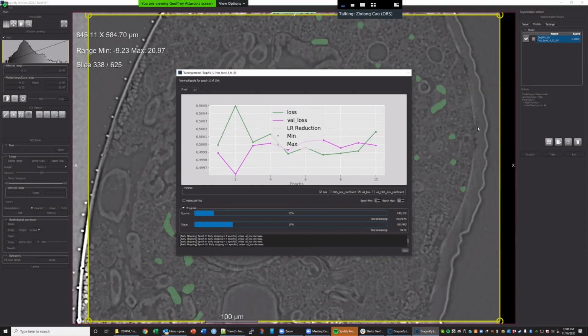Ideally, it should work better for most images, but it takes so long. It's very slow. If you don't have a super powerful GPU, it will be super slow. So it's not very practical to begin with. Right? Yeah.